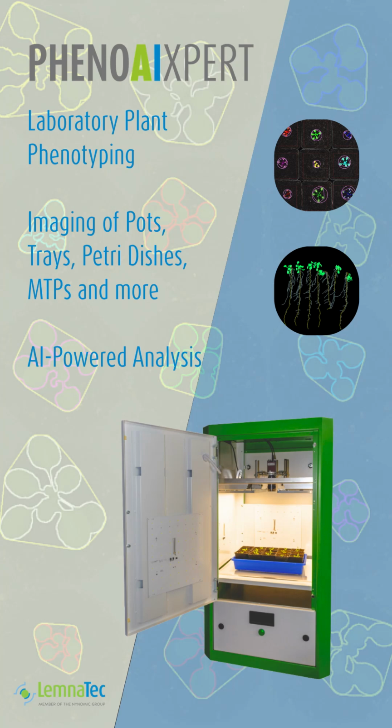Phenotyping with the LemnaTec PhenoAIxpert. The PhenoAIxpert is a laboratory plant phenotyping system. It's dedicated to image pots or trays, petri dishes, MTPs and more. It comes with an AI-powered analysis of the taken images.